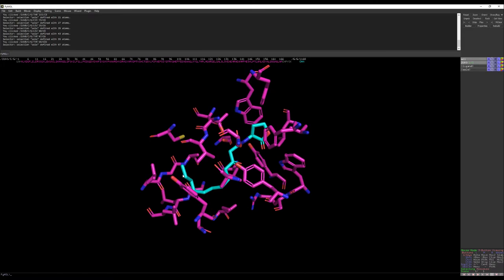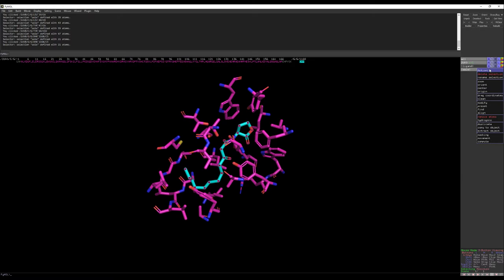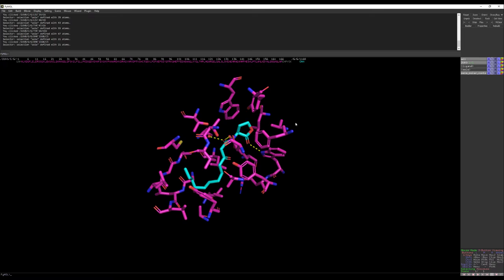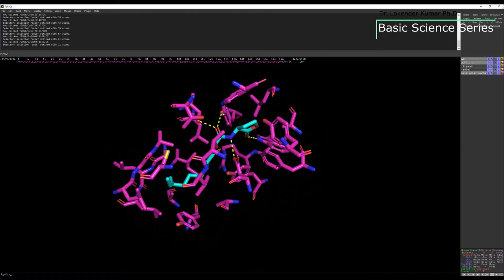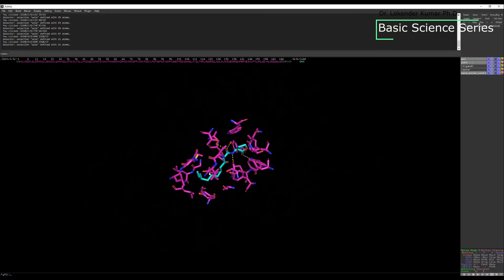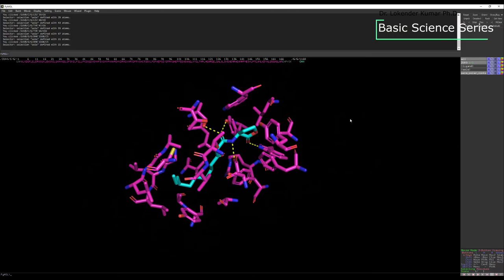Another important piece of information to extract is the residues forming polar contacts with the ligand molecule. Select the ligand, go to the SELA tab, go to A, then find polar contacts to any other atom. A yellow dotted line will appear showing what residues are forming polar contact with the ligand. You can then hide all the other residues if you don't want to show them in your final PyMOL figure.